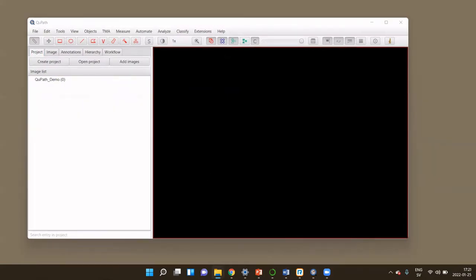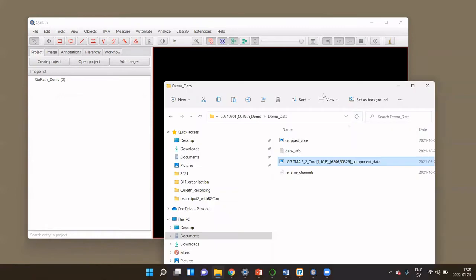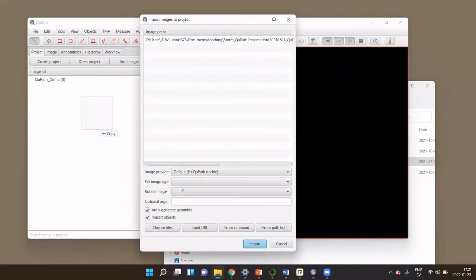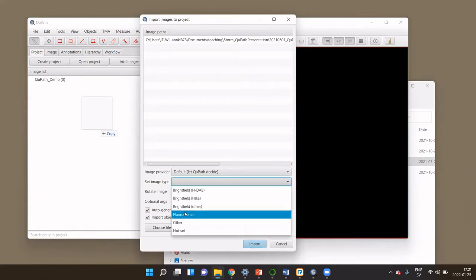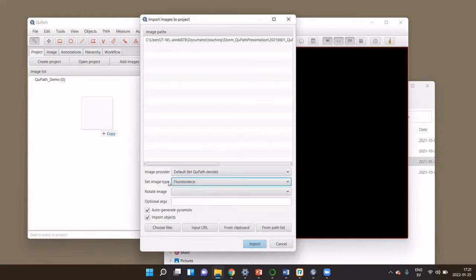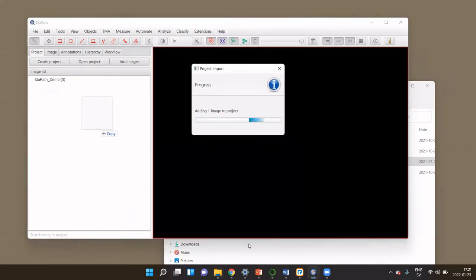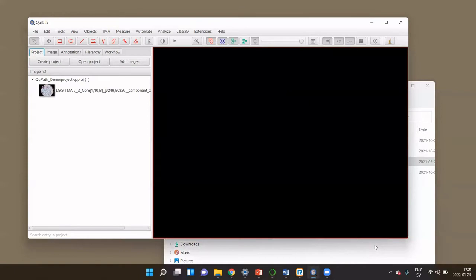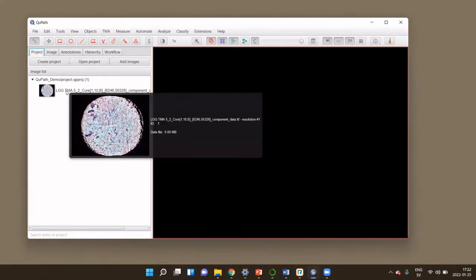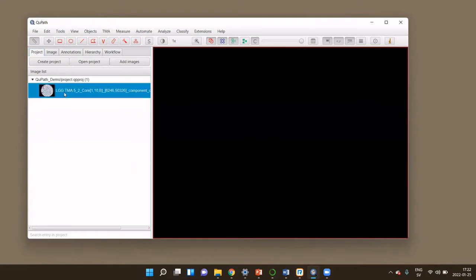To import an image into our project, we can just take the image and drag and drop it onto QuPath. In our case, what we need to do is set the image type. We have a multiplex fluorescence image, so we want to pick Fluorescence under the image type. Then we can click Import. The image will stay in its original position, and the project will just store the information of where QuPath can find your image. To work with the image, you need to activate it by double-clicking on it.